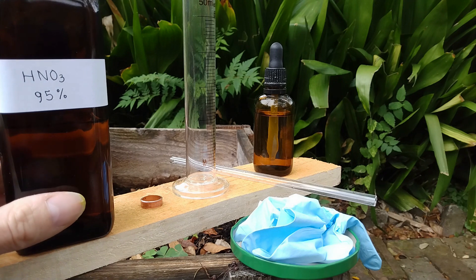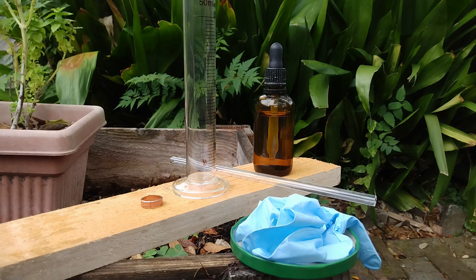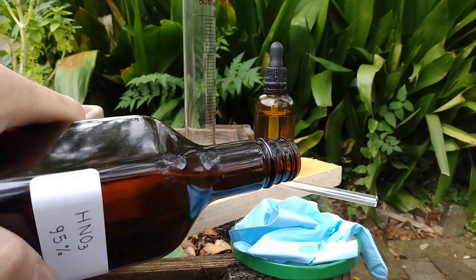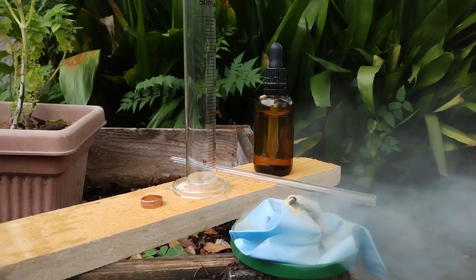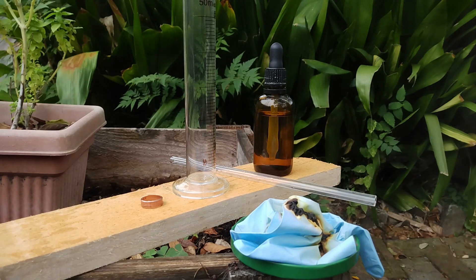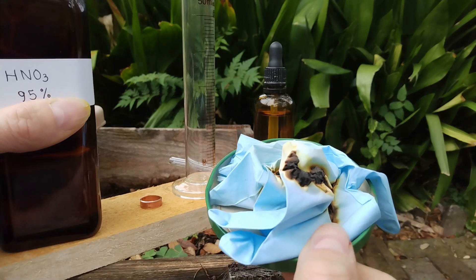You may wonder: if this acid is so strong, why am I not using gloves to handle it? Well, the reason is that here is what happens if you wear latex gloves and pour some acid on them — it kind of catches on fire. The flame turned off because there's quite some wind, which is good because that makes all the fumes move away from me. The fumes are very toxic, so you shouldn't breathe this.